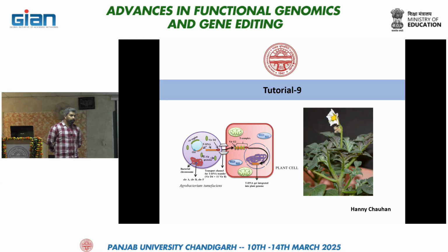From Addgene you can download the sequence for the vector, and you simply have to digest the vector depending on the site where you want to add that single guide RNA. After digestion you have to form the oligoduplex for your designed single guide RNA, for which you have to add particular restriction sites at the 5 prime end and at the 3 prime end. After that you have to ligate that in the vector.